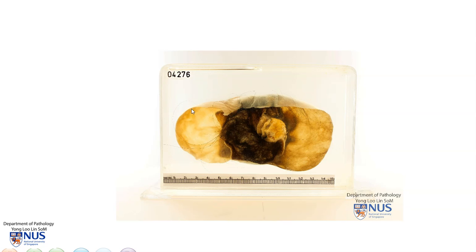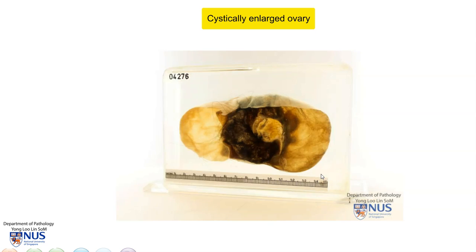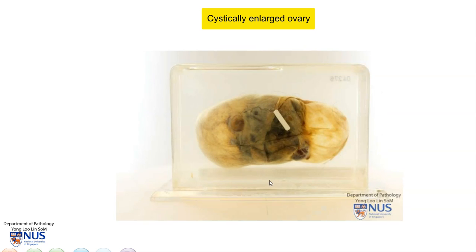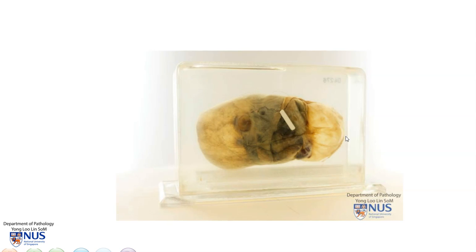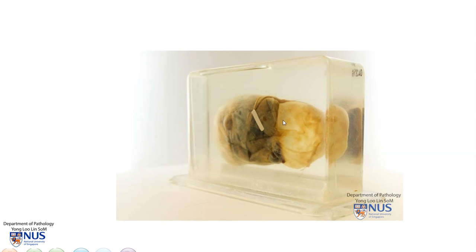Hello, this is a pathology specimen of an enlarged cystic ovary. We're looking at the cut surface here, and turning this around, this is the serosal surface — the outer or capsular surface — and we can see that it is quite smooth and there are no obvious masses on this surface.